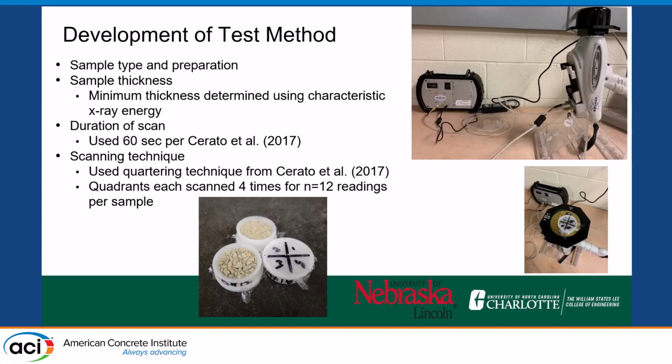So the chemical composition from the chemistry lab, they pulverize it and actually physically test the full sample. The XRF only bounces off the surface and goes to a certain depth. I think for some elements it's pretty shallow, hundredths to thousandths of an inch. And I think our deepest element, the penetration depth, was 0.16 of an inch. So we knew we're not going to directly measure composition, but can we predict it?